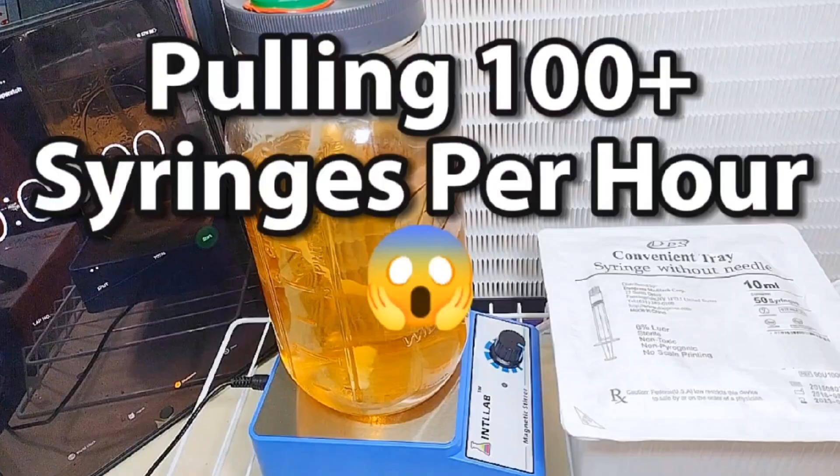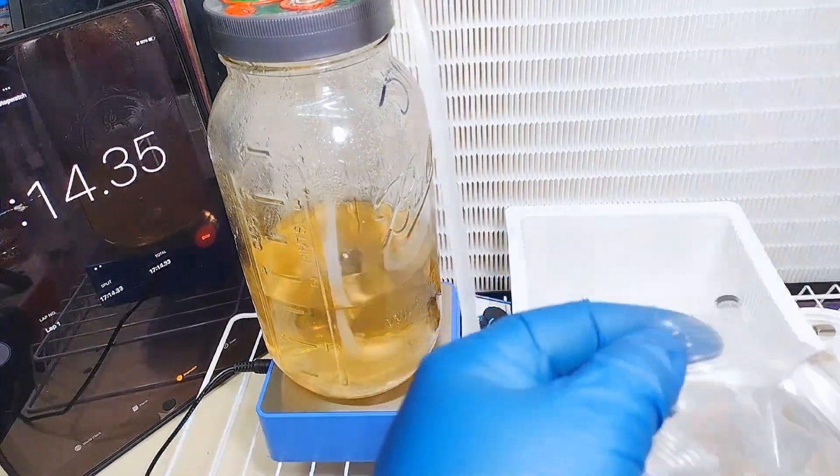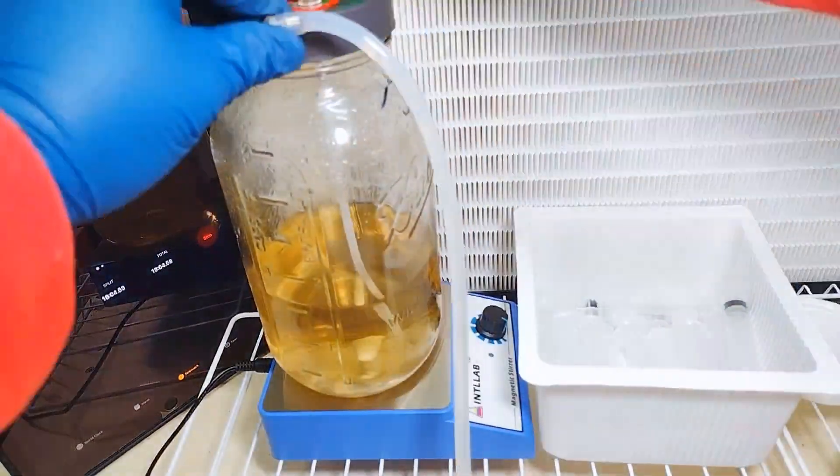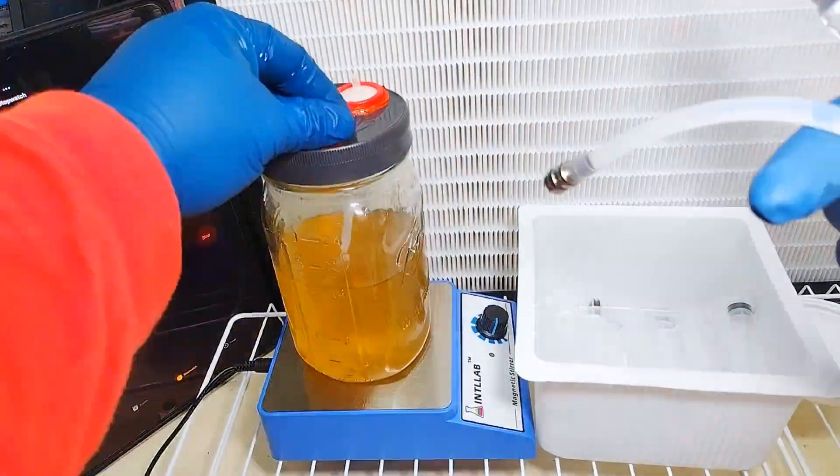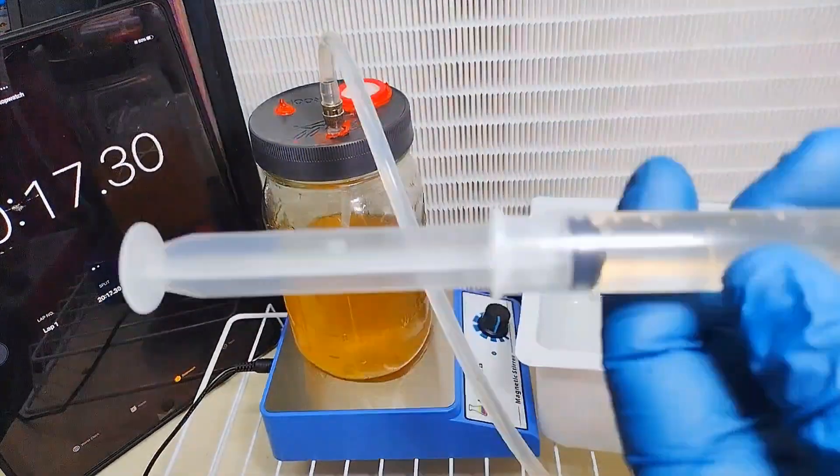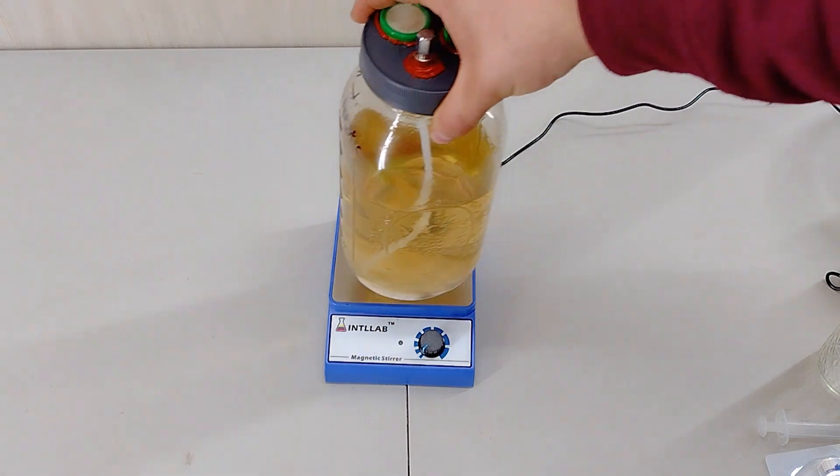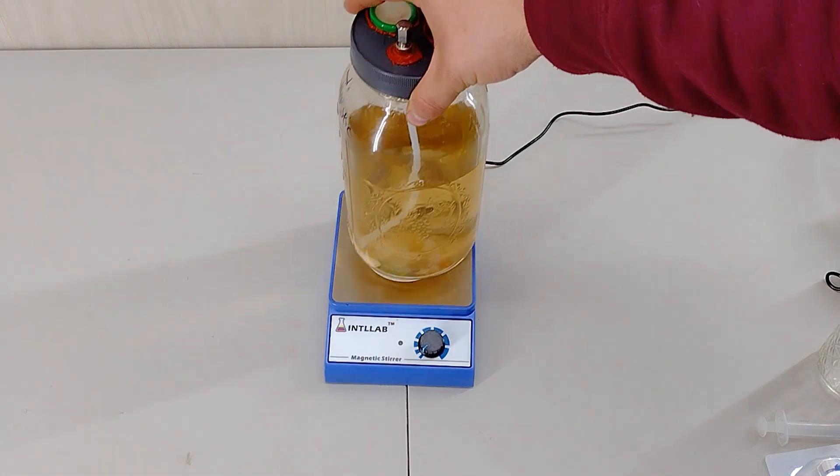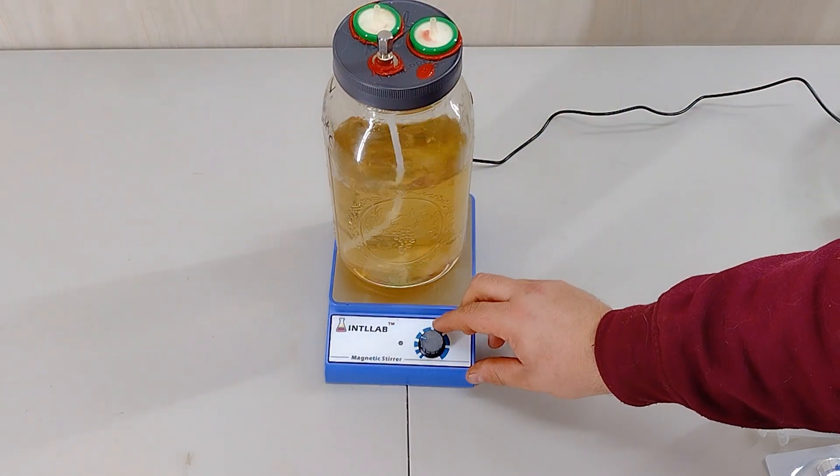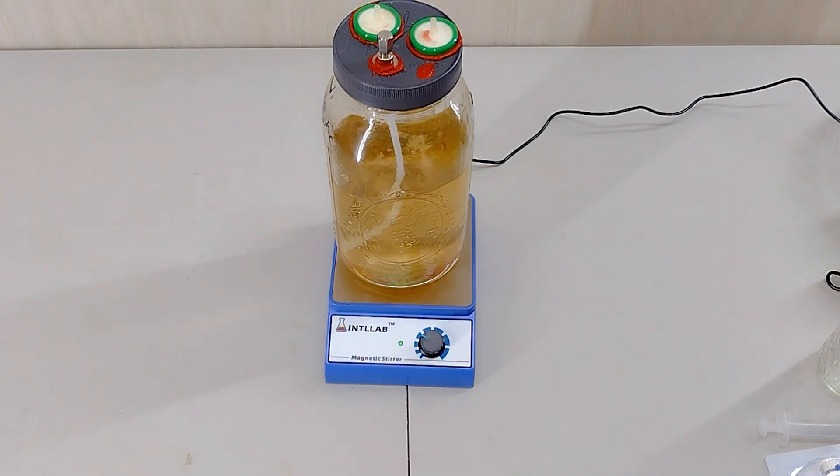Now, some of you will remember the video I posted pulling 100 syringes per hour. This is the exact tool that was used in making the video. Now, sit back and enjoy, and I'll show you exactly how I set this up. Now, besides making liquid culture and spore syringes, you could also use it to inoculate bags as well, so keep that in mind while you're doing your stuff. Maybe you could speed up your process a little bit with this method.